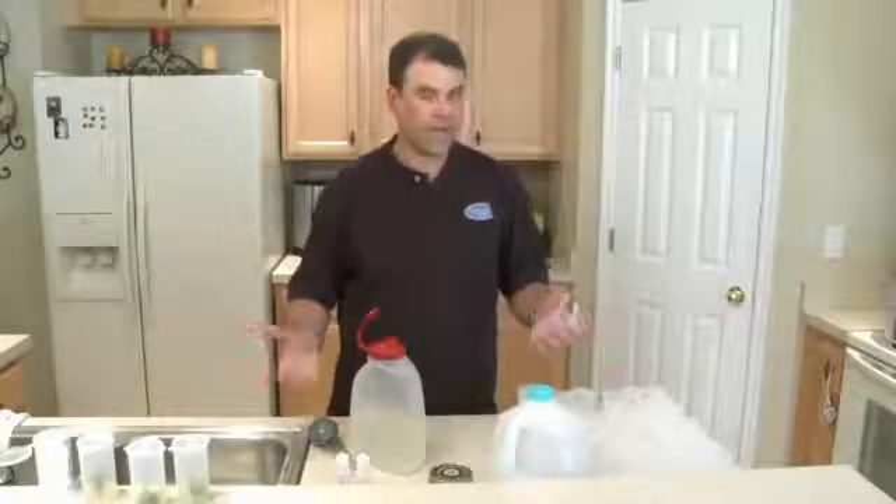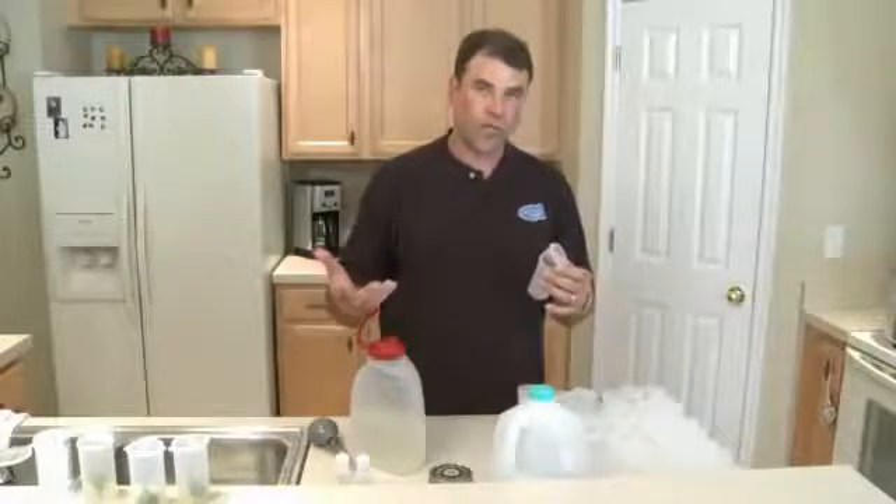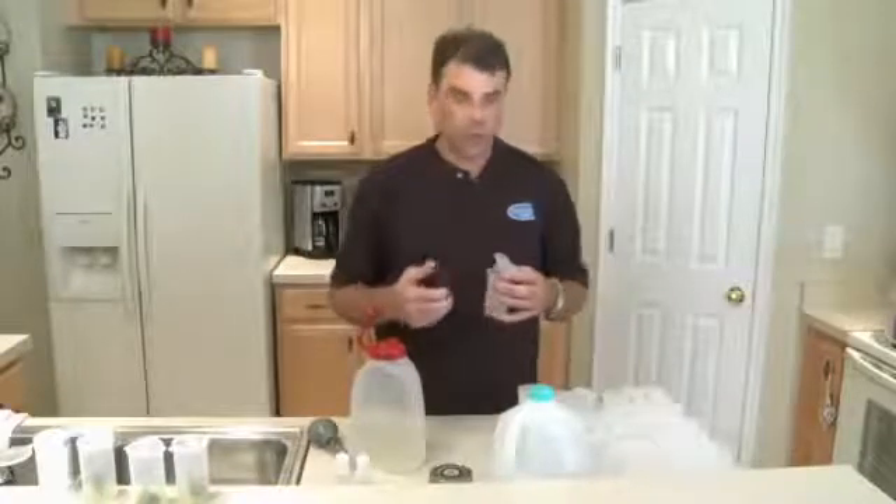We're going to go through and fill all these guys. Then we'll prepare the pressure cooker, put everybody inside of it, set it, let it operate, and then we'll be taking these out to cool. And when they've cooled, we're going to have all of our tissue culture vessels with gel in them, all ready for our plants.